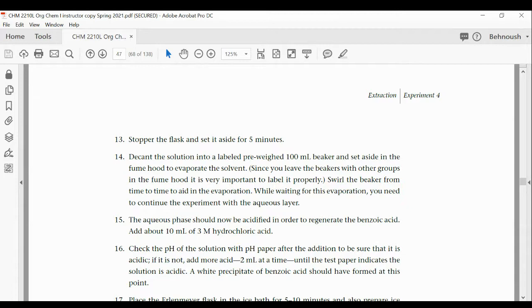Yes, the water. If there is any water left in the liquid, then when you are evaporating the ether, the water will stay and you cannot dry your product, and it is going to give you false results. By false, it is going to give higher mass. At the same time, your sample is not pure and it is going to affect the melting point. So higher mass, and also the melting point would be off, or affected. So you don't want that.